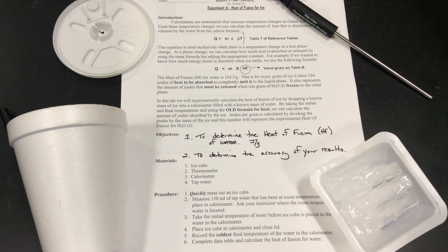Then we're going to determine the accuracy of our results, because we already know what the answer is. The theoretical value has been determined by someone doing this a thousand times, so we're going to have some error. It's a very simple lab, but let's talk about the process before we get to it.